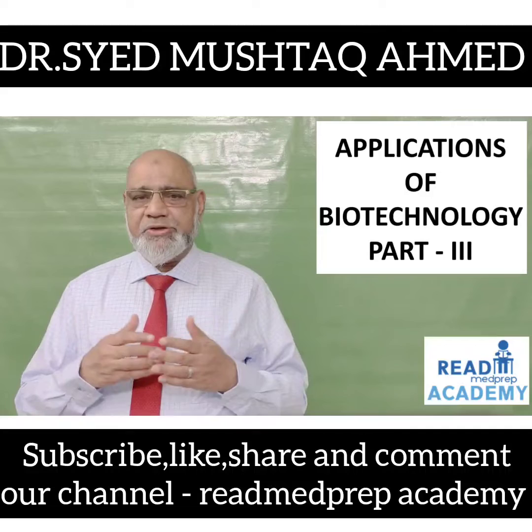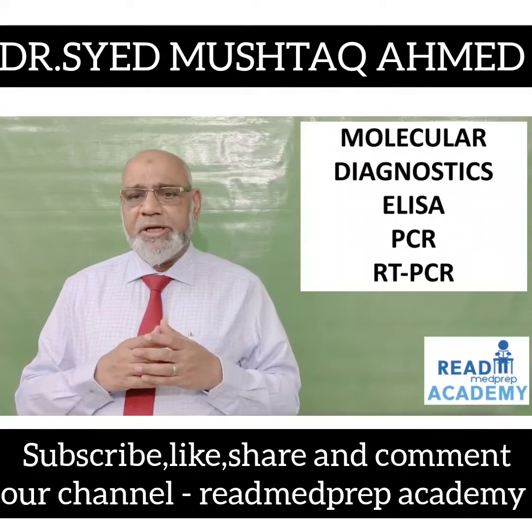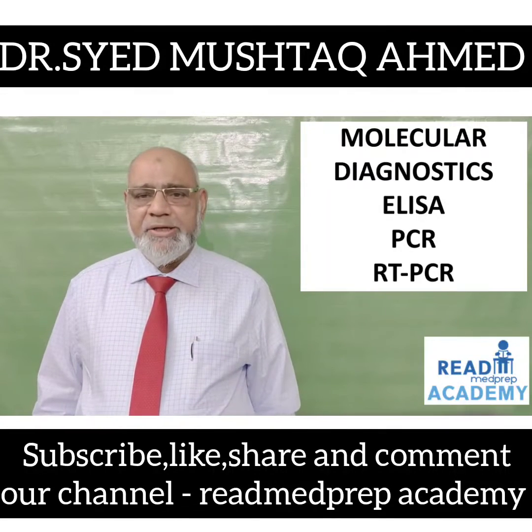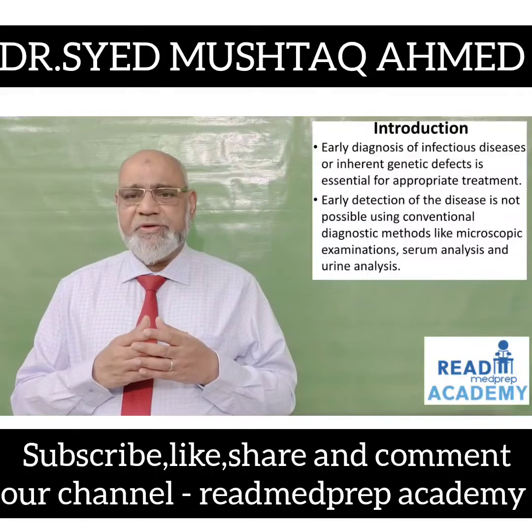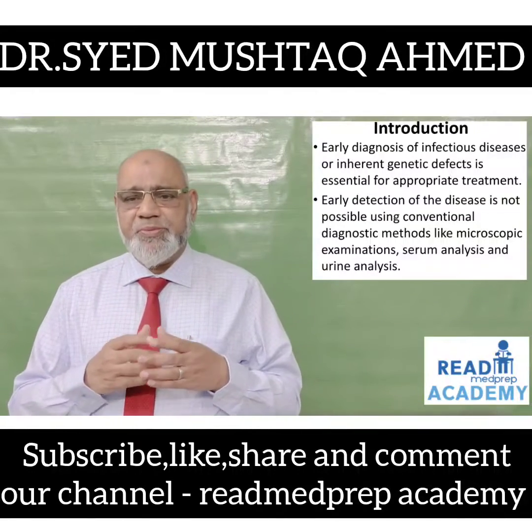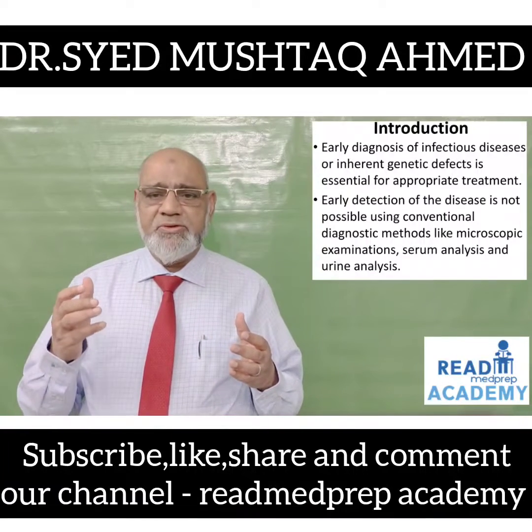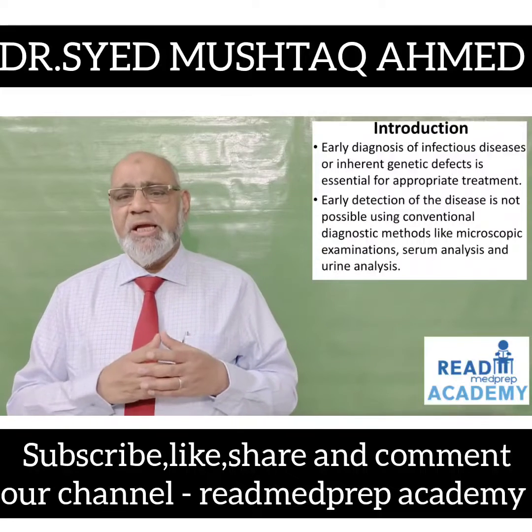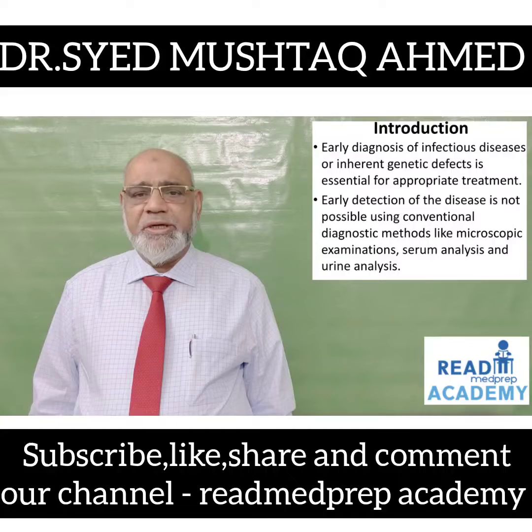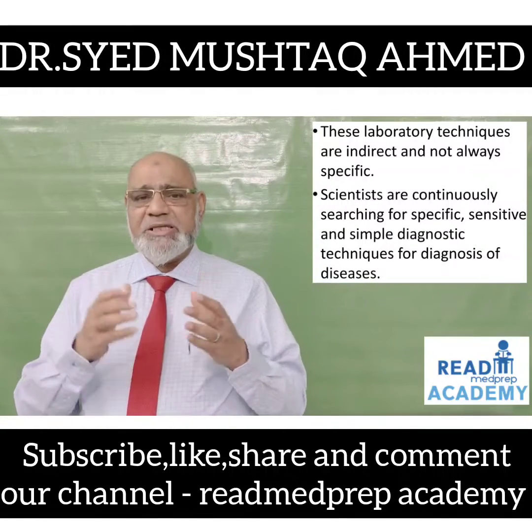Today in Applications of Biotechnology-Part-III, we are going to talk about the molecular diagnostic techniques like ELISA, PCR and RT-PCR. Early diagnosis of infectious diseases or inherent genetic defects is essential for appropriate treatment. Early detection of the disease is not possible using conventional diagnostic methods like microscopic examinations, serum analysis and urine analysis. These laboratory techniques are indirect and not always specific.